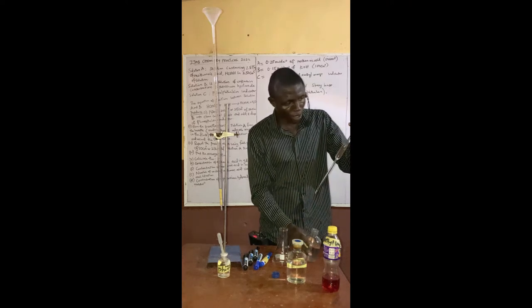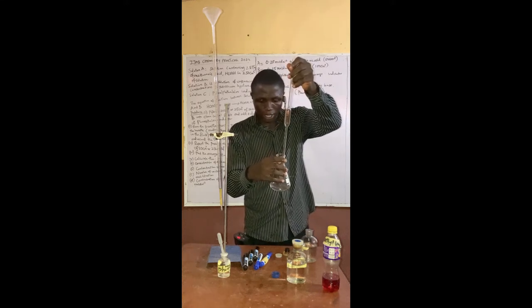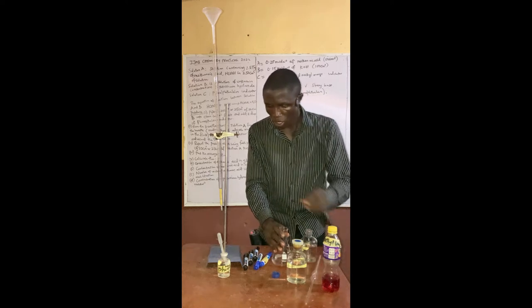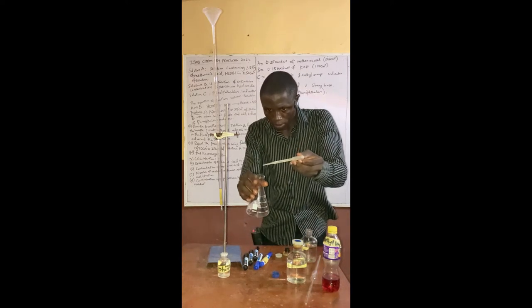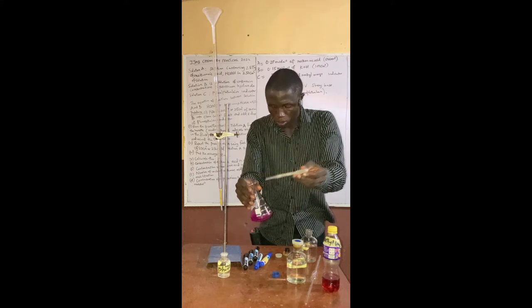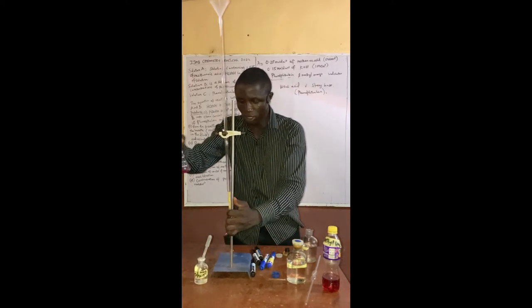So this is 25 centimeter cube. So you pour inside the what? The conical flask. Then after doing that, you add 2 drops of what? Of phenolphthalein. One, then 2. So that's that. You can see the pink color change here.